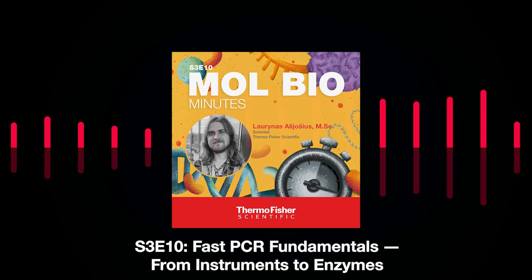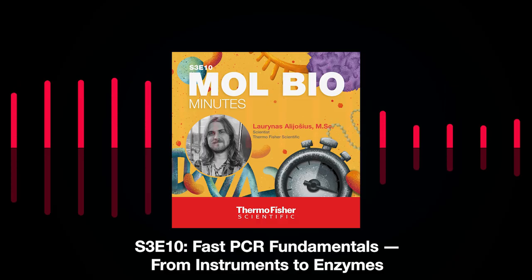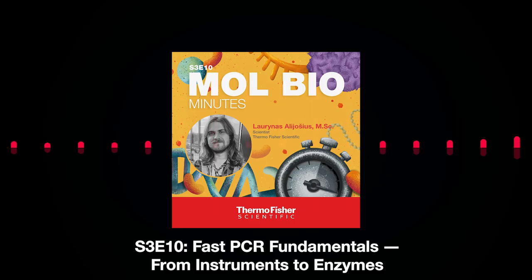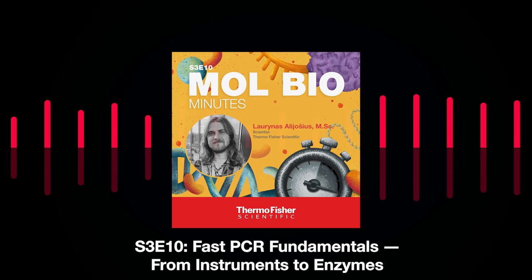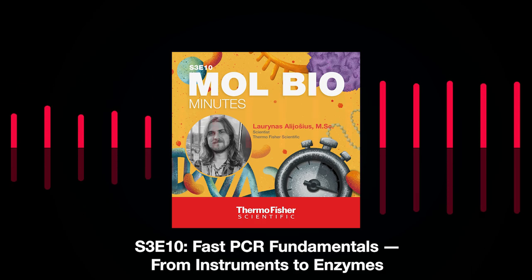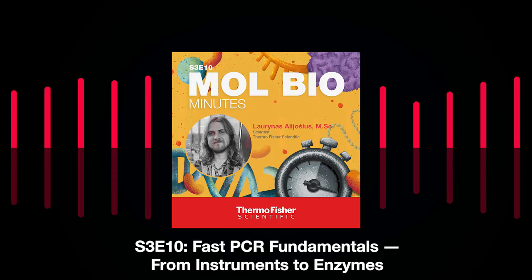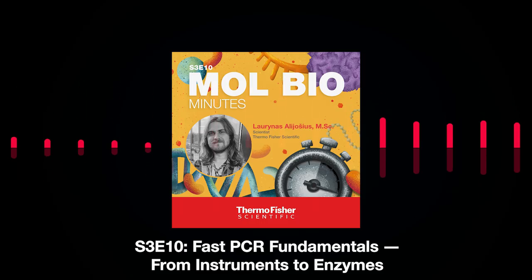It can be activated either by chemical modification, which takes up to 10 minutes and is a bit slower, or it can be activated by antibody or aptamer mediated technology, which is much, much quicker and only takes seconds. So, for example, our Platinum II Taq Hot-Start DNA polymerase uses the aptamer antibody mediated technology, which is the quicker one.